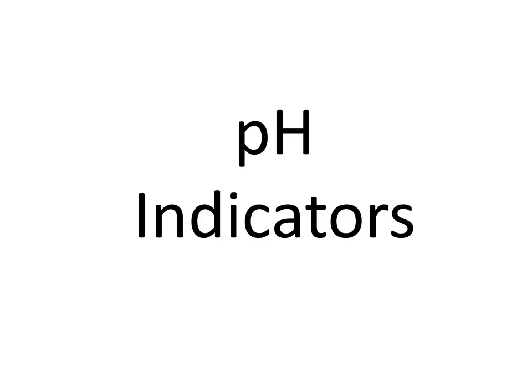This is a very brief video on pH indicators. These are important because we use them in lab just to indicate the general pH of a solution. Also, we use them extensively in titrations to indicate the end point of a titration, which is hopefully close to the equivalence point of the titration. And there's more about pH indicators in the titrations video, which will come after this one.